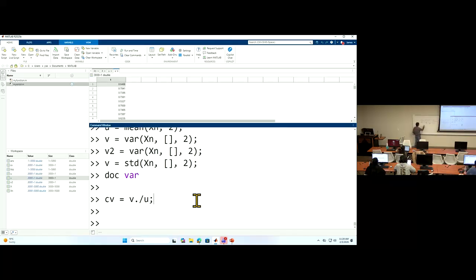Now we are going to plot a scatter plot, something like this, for gene-wise. We are going to put the mean here, which is the mu value, and the CV here. In this scatter plot, each point will be a gene. If we have a gene with this particular mean corresponding to this CV, we will put that gene here.